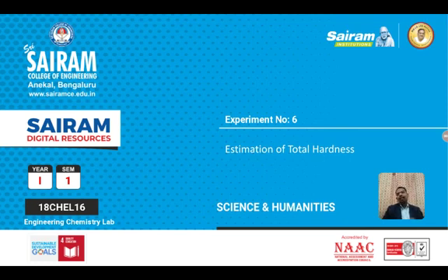So now we are going to come to a new set of experiments, volumetric estimation. Volumetric estimation means we're going to give a sample and then determine the constituents, how much amount of constituents are present, right? So volumetric estimation is titration, it's a classical method. The same thing can be done by instrumentation. The first experiment in this volumetric estimation is total hardness.